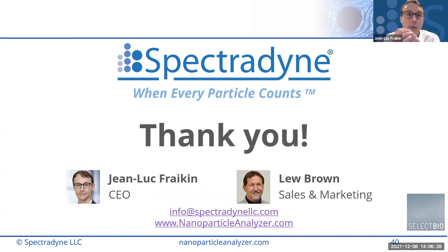So first one was from Arnab Rudra. I understand that we have to use tween, but what if the LNP is not compatible with tween for some reason, or how do we know if tween is not affecting the LNP?